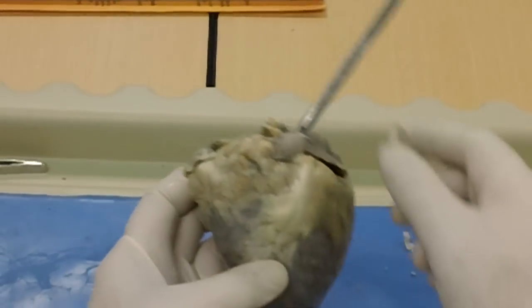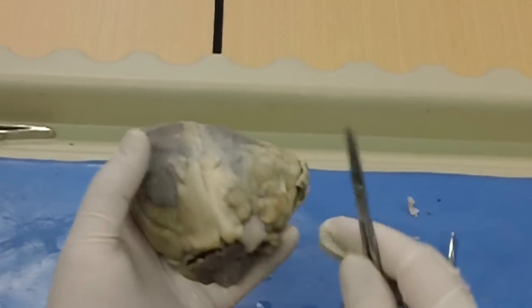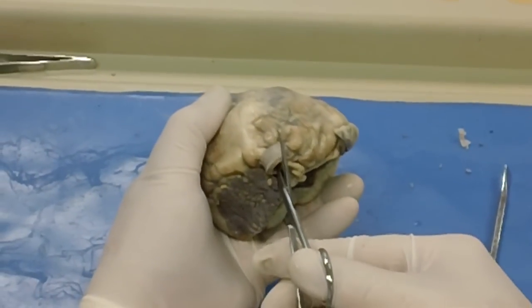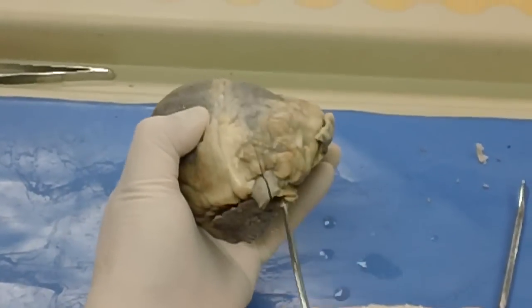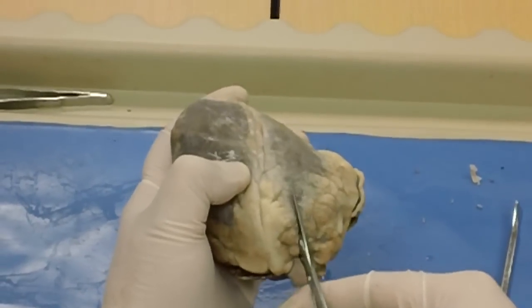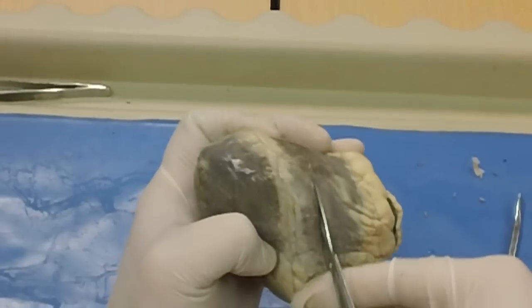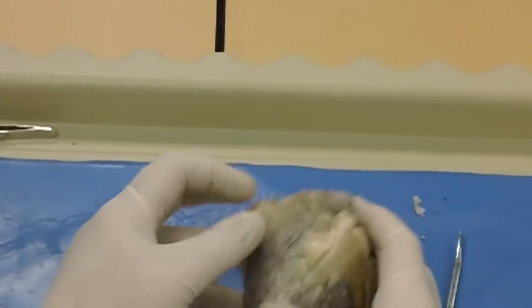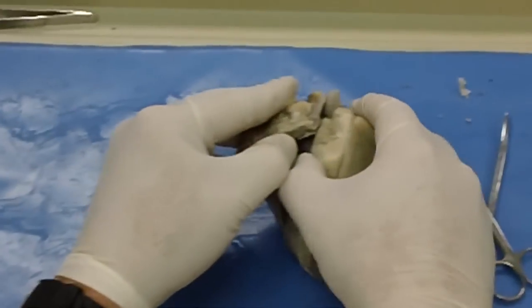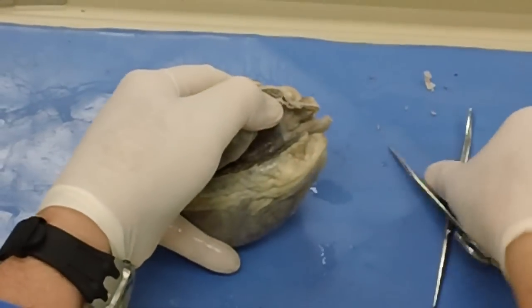If that's the pulmonary artery, and I make an incision down this opening and cut like this, I should be able to open that up and see the pulmonary artery and the pulmonary valve.